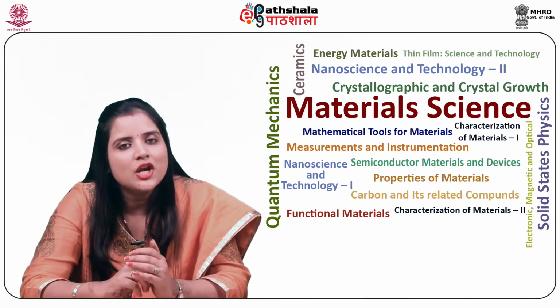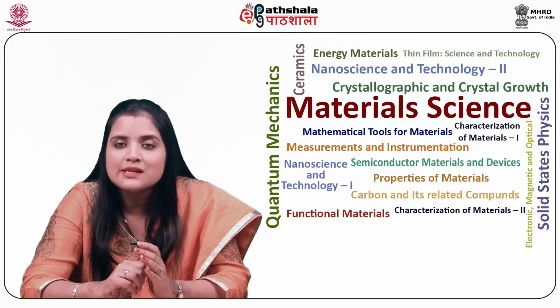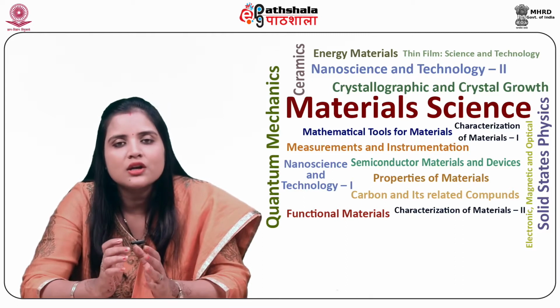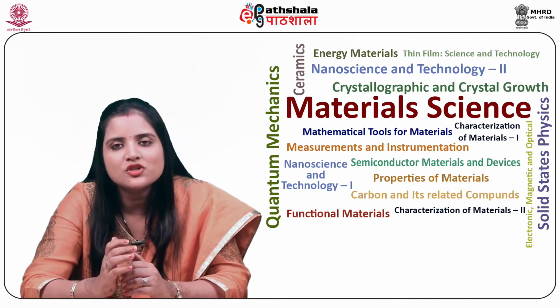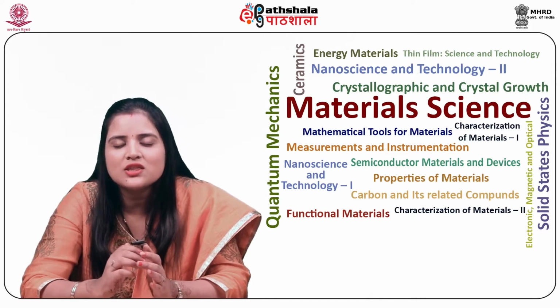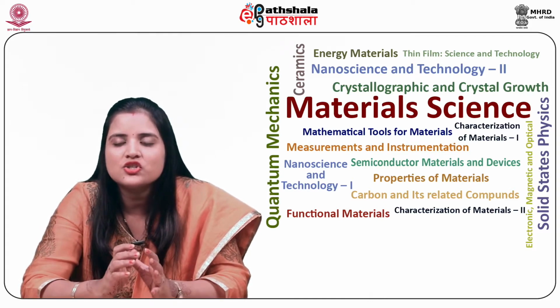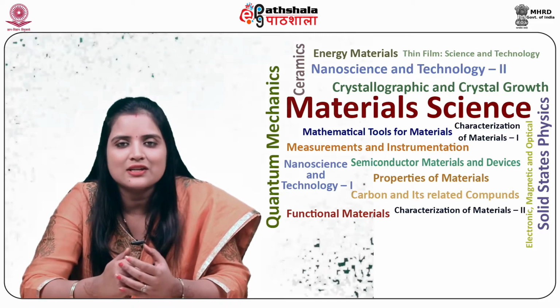So, the suggestion for such a problem is that low vacuum SEM can be used to analyze non-conducting samples because residual gas molecules present in the sample chamber scatter the high energy electron beam, thereby increasing the analysis area.